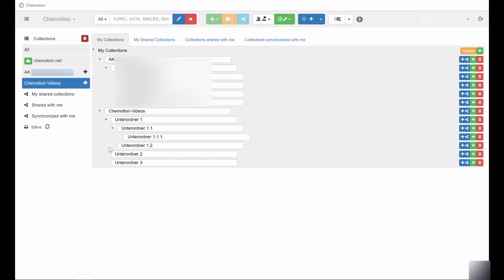For each subcollection, you can add new subcollections and so on. This allows a systematic as well as individual structuring and organization of the entries and research data.